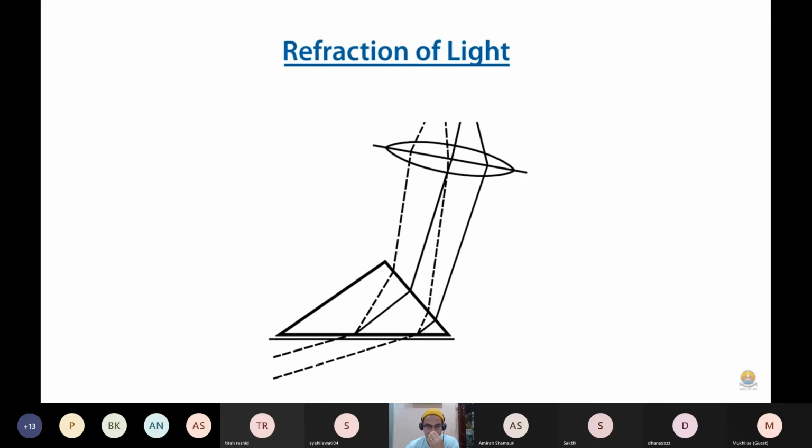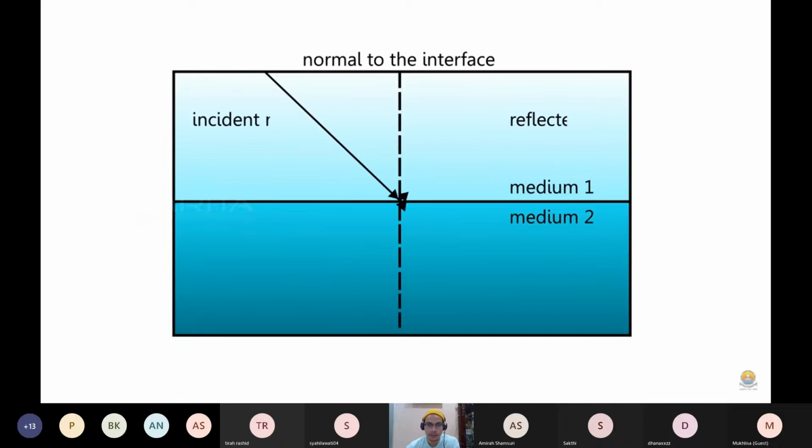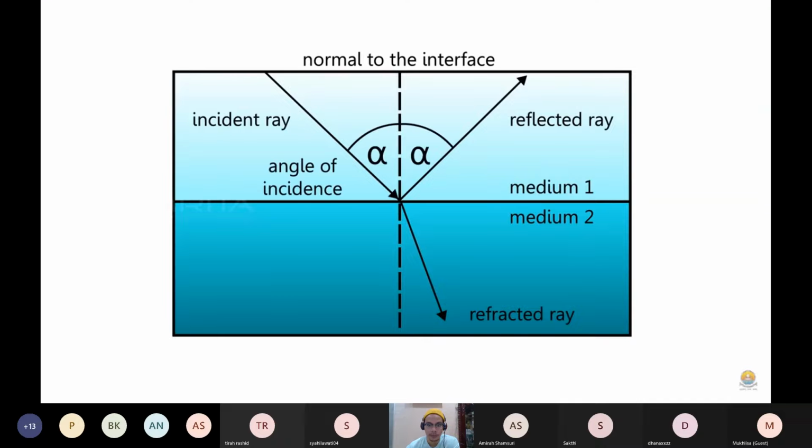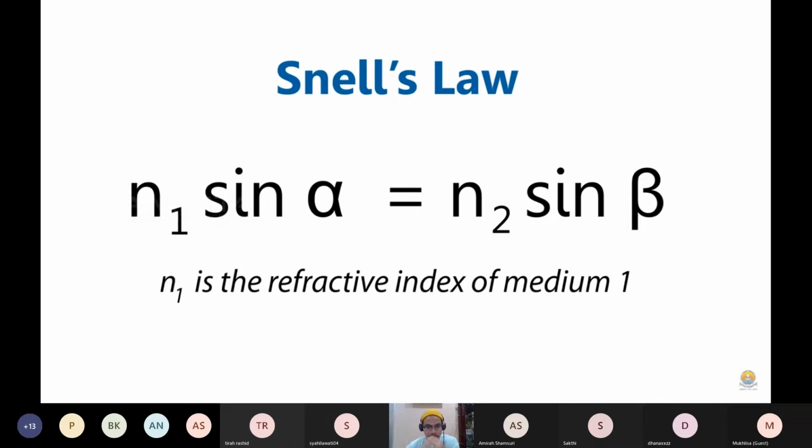Okay, so how this test works is that we manipulate the refraction of light. We identify the angle at which the light is refracted bila the light passes through the medium. So kita perlukan ubat tu dalam bentuk liquid. Kita akan pancarkan satu cahaya menembusi ubat tu, dan kita boleh ambil bacaan angle. This is the equation to determine the refractive index.